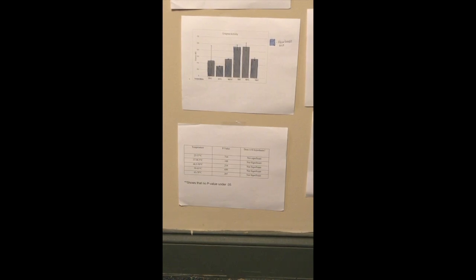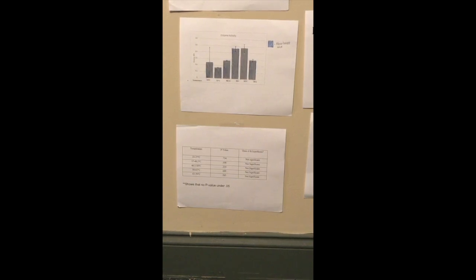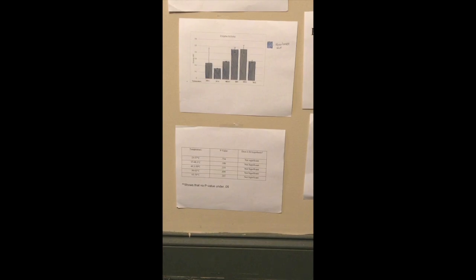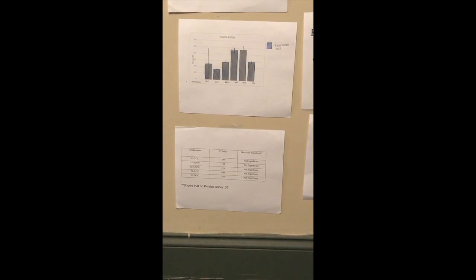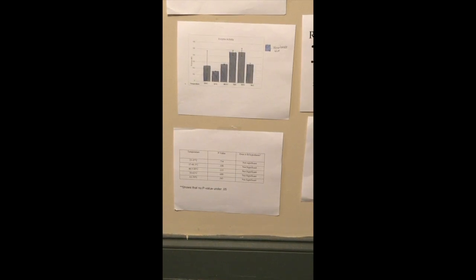I think our experiment was properly executed. We had 3 test tubes for each of the given temperatures, and we had negative controls for each temperature. To prove our hypothesis in the future, I feel that we must have a wider range of temperatures and maybe even go further than 70 degrees to really show a drop-off in enzyme activity.